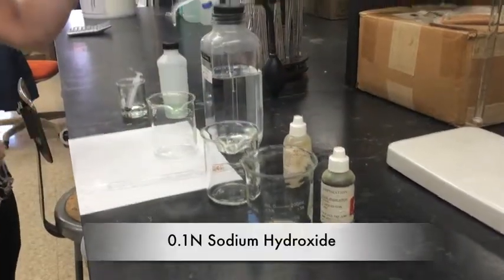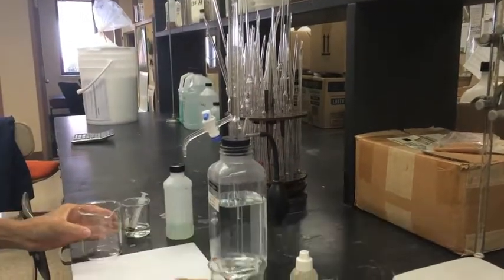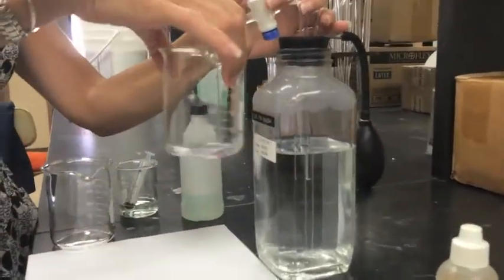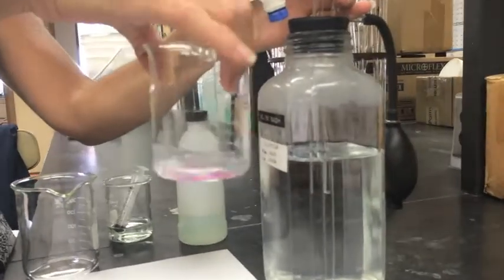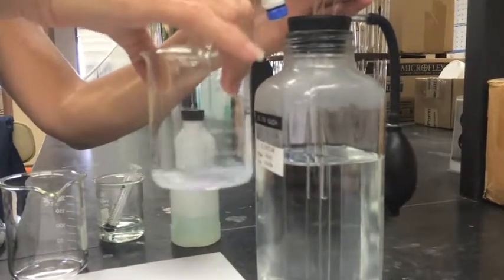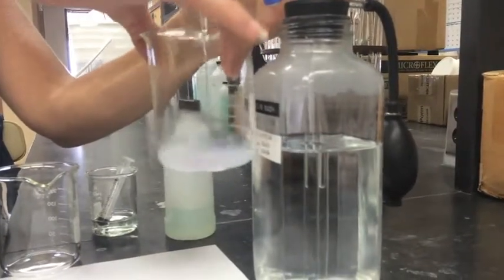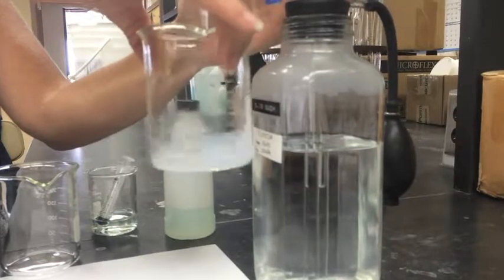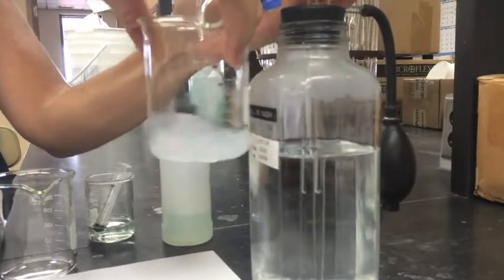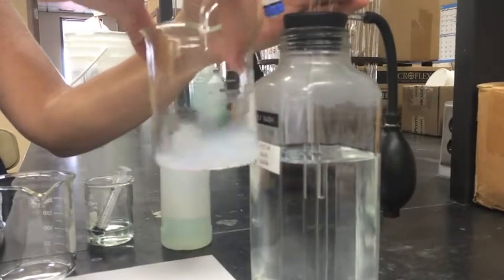We're going to titrate using 0.1 normal sodium hydroxide, and my burette is filled to the 0 mark. And we're going to very slowly and steadily add the sodium hydroxide with mixing to our sample. And what we're looking for is a pink endpoint. If you note, what I'm doing is I'm adding 4 or 5 mils at a time, swirling the beaker with no addition, and then adding a little more. We want to be careful not to titrate too fast so that we go right past our endpoint.